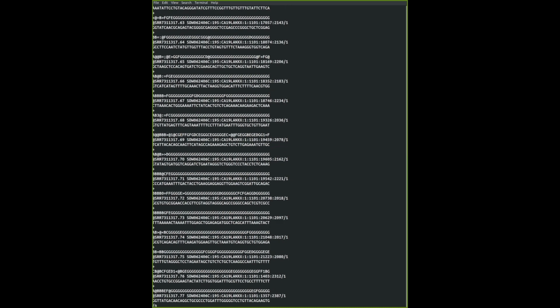you want to search for something. Let me see, it's / and then followed by anything that you want to search for. If I want to search for capital N, I think I press enter. No, and enter. Oh, it's not working now. It's not working. Oh, it's crashed.